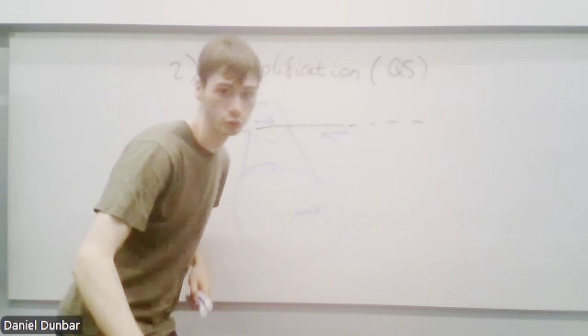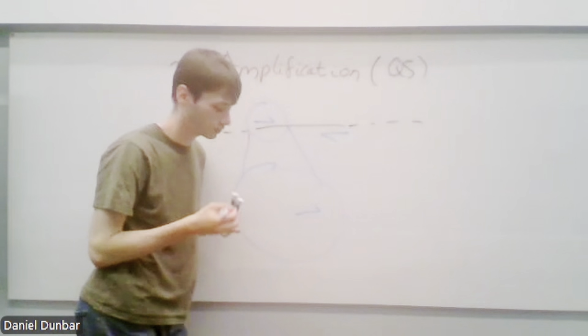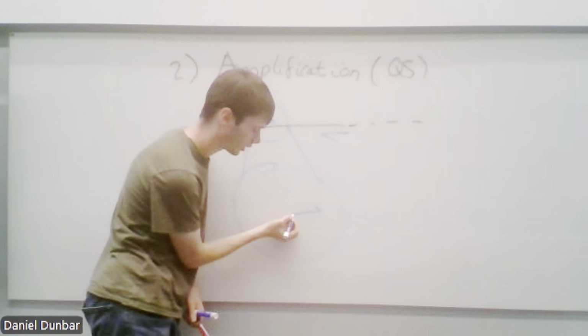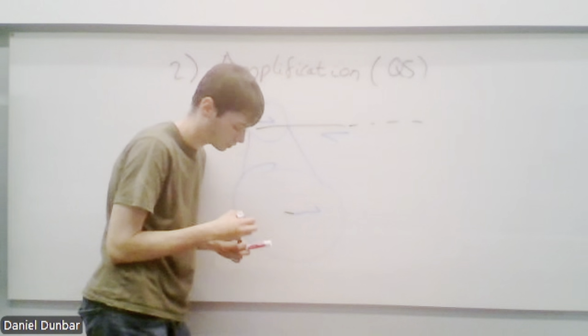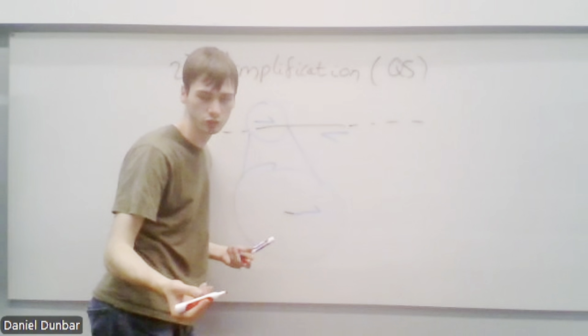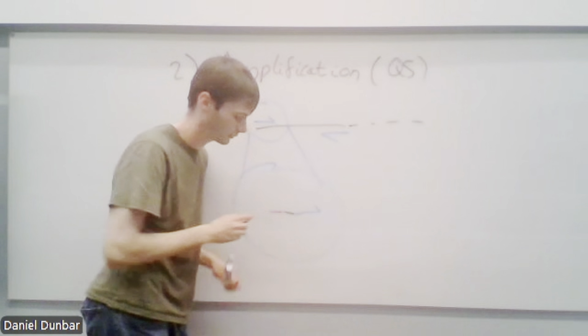And then we would include a site. So if this was for a Golden Gate purpose, what I would expect to see is my 4 base pairs that would be complementary in black, and then my BsaI or whatever restriction enzyme I'm using, I'd see the type 2S restriction enzyme recognition site.